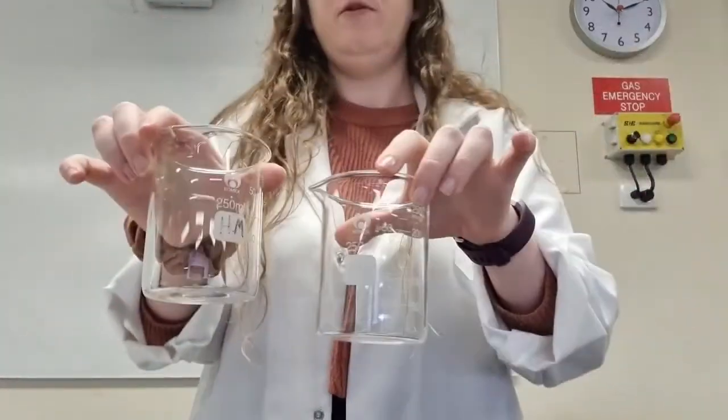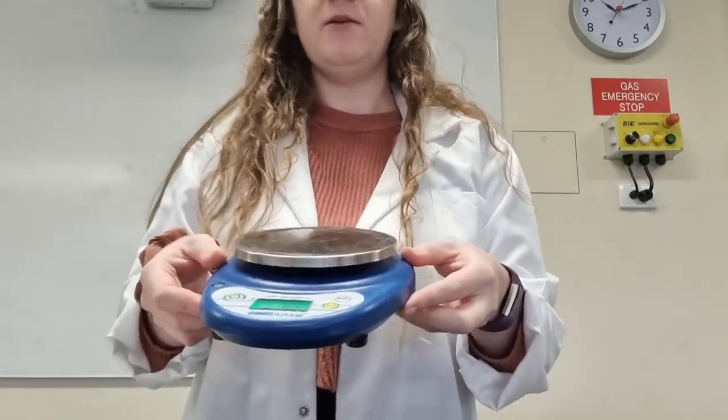So what I have here in terms of my equipment, I have 4 250ml beakers. I have my electronic balance so I can weigh it.